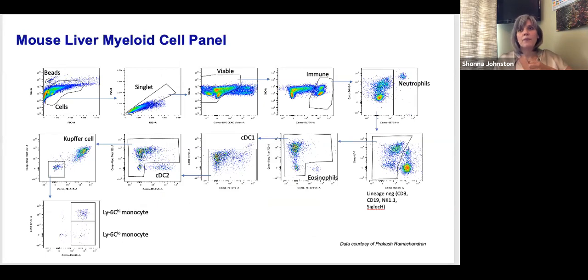Now, Prakash, who gave me this data, although he didn't include it in the slide that he gave me, did say it was worth highlighting that the AF channel, the autofluorescence channel, helped him separate the myeloid and the lymphoid cells much better. And although again he's not shown it here, he was able to separate the lineage positive compartment quite easily into T cells, B cells, etc.